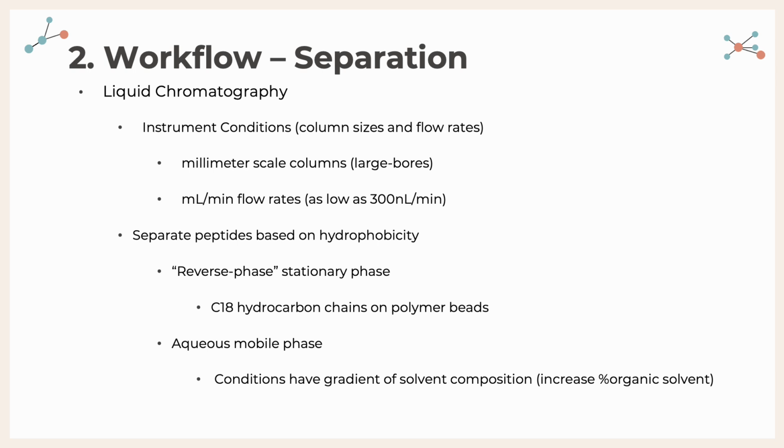So we have our first of two instrumentation steps right now. In proteomic analysis, this first step is the separation step, where you're employing liquid chromatography. There's nothing much to say about this liquid chromatography. It is reverse phase, so your hydrophobic stationary phase and your aqueous mobile phase with the increasing organic solvent as you move on.